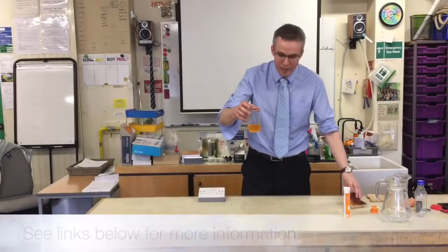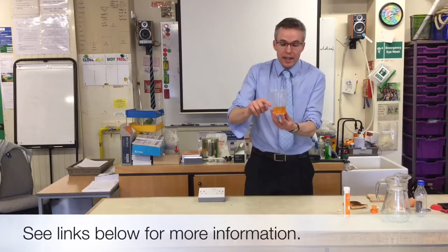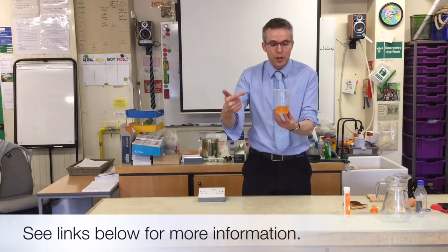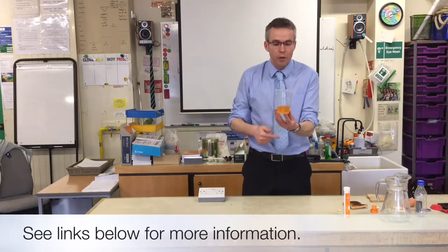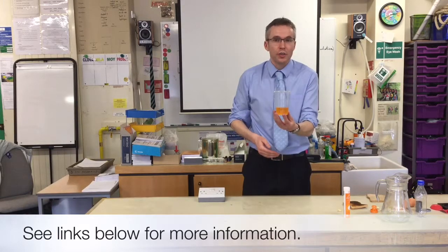So just to summarise, a good little chemical reaction to start with. Fizzing, gas is given off, colour changes too, and they're two signs of chemical reactions. So a nice little intro to chemical reactions.